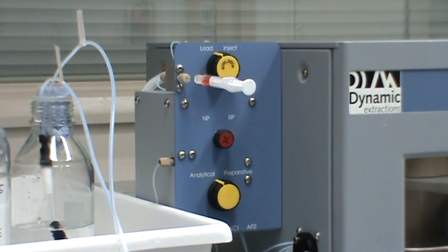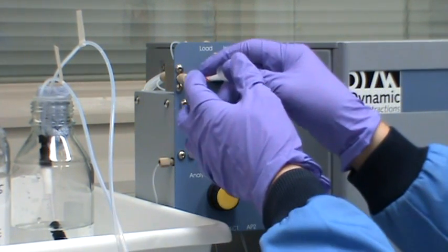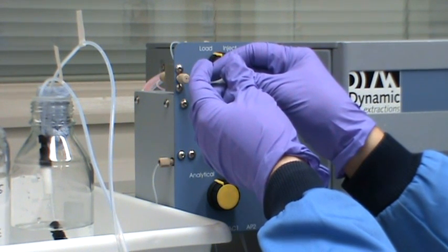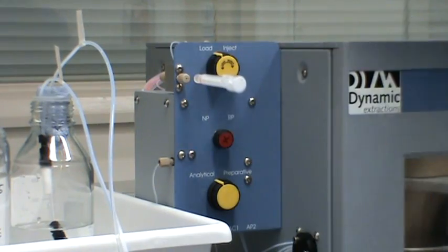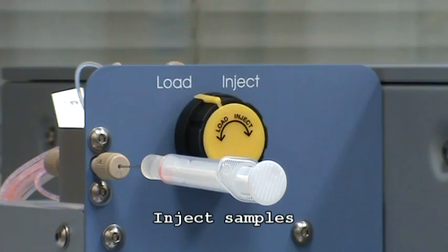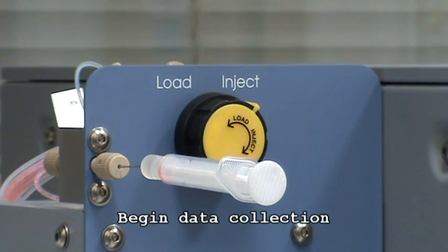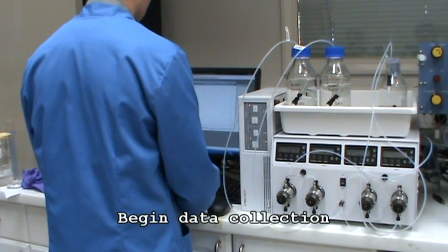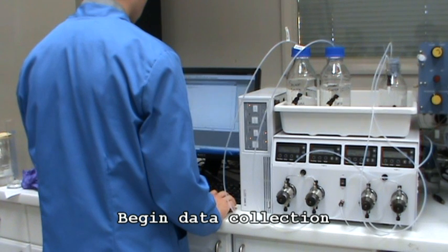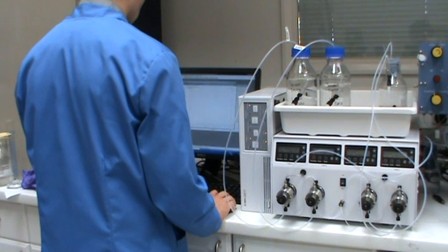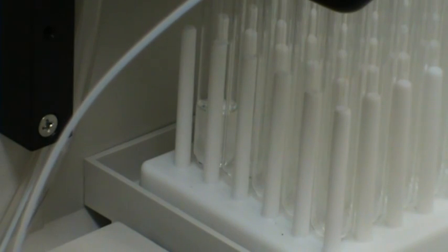Inject the dissolved sample into the sample loop of the valve box. Once the sample is in the sample loop, turn the valve box to inject and the sample will be pumped into the column. Now begin the data collection software.